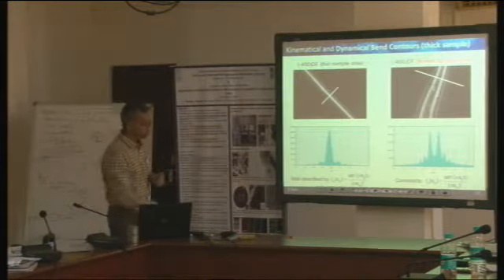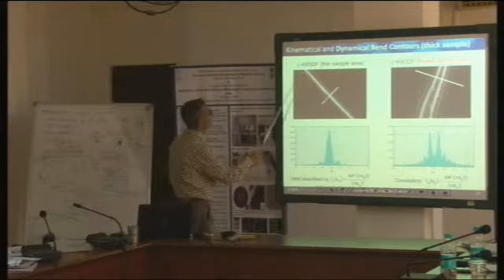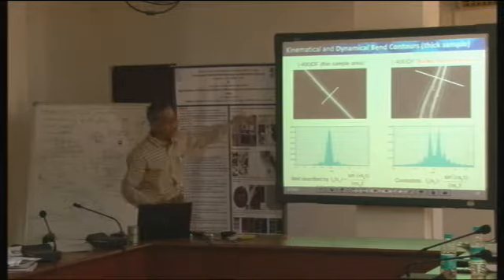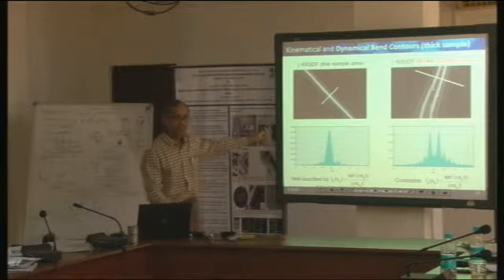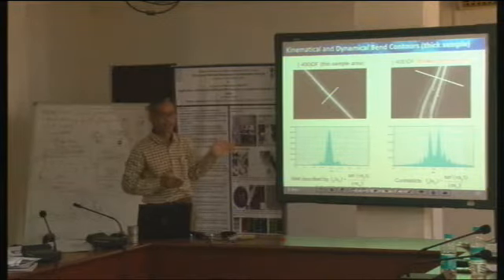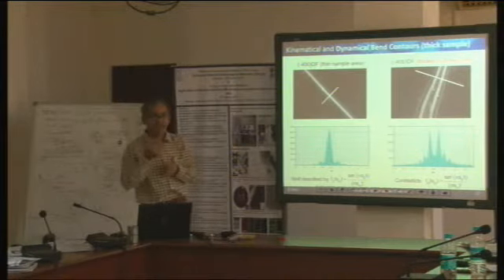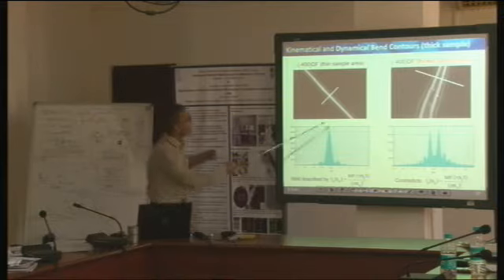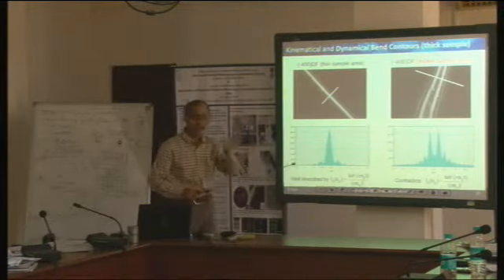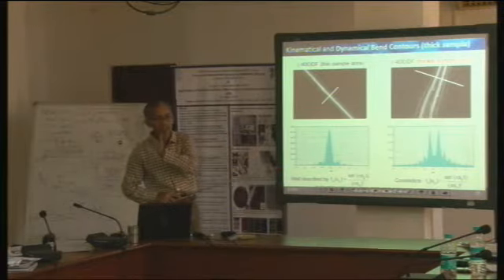When I have this dark field image, I know I have acquired it with the 400 reflection. I know only those regions are bright where the 400 lattice planes are satisfying the Bragg diffraction condition. So I have this additional information that in this part of my sample, the 400 lattice planes are satisfying the Bragg diffraction condition.